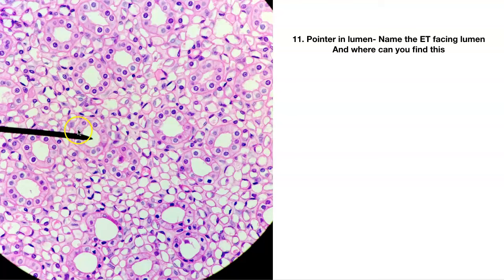Number eleven — pointer in the lumen. You've got lots of these in this slide. This is easy: simple cuboidal. Where do you find that? You're going to find this in the kidney tubules — lots of tubules in the kidney — and in glands.